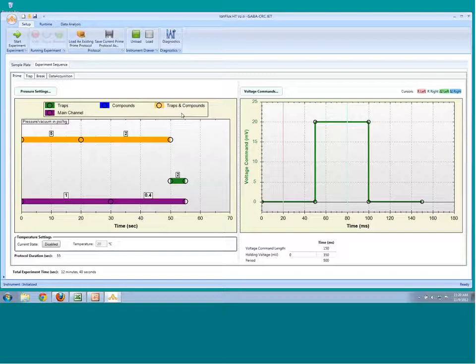So during this priming phase, we're not pulling any cells onto our traps, or more importantly, pulling any compounds that might be flowing past into the recording trap. So positive pressure would be kept right up until we want to patch the cells, at which point we would be going from holding positive pressure to vacuum to draw cells onto the trap and make our whole cell recordings.